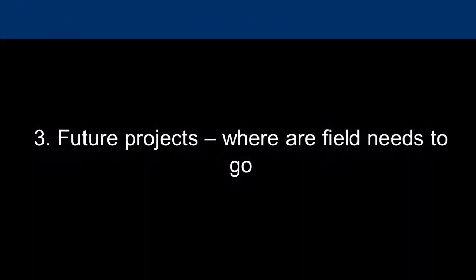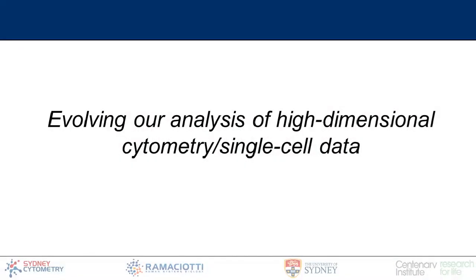Now, what I would like to finish on is just a couple of thoughts about where this field needs to go. So we have some very good ways of doing analysis of suspension data from CyTOF or from Flow, as well as from imaging data, but we need to go further in terms of the way that we can integrate and apply these analytical approaches.